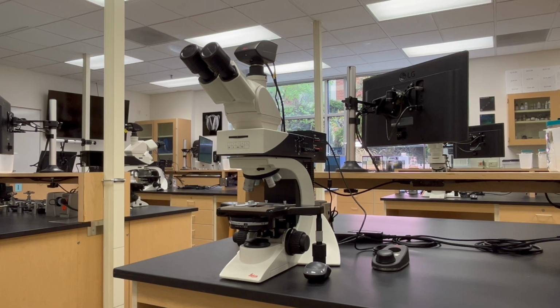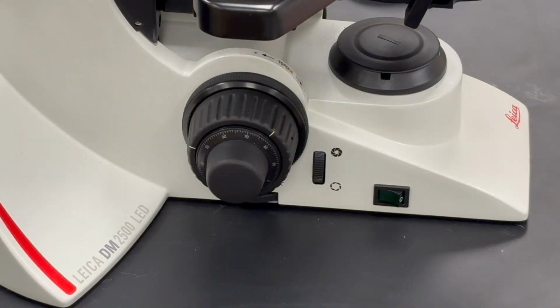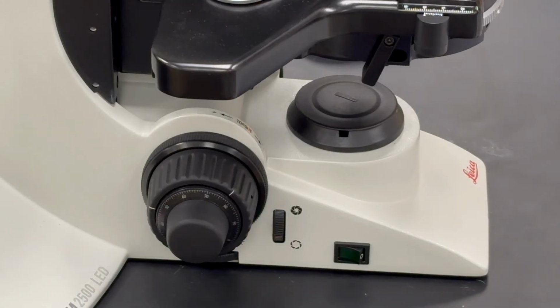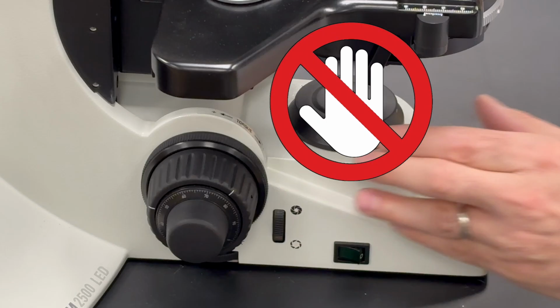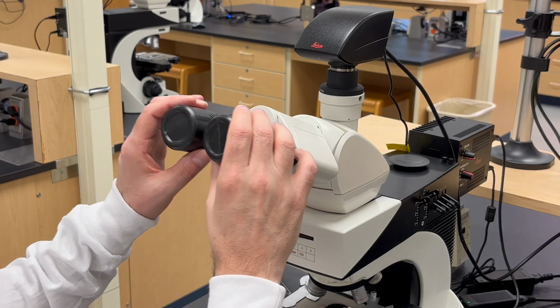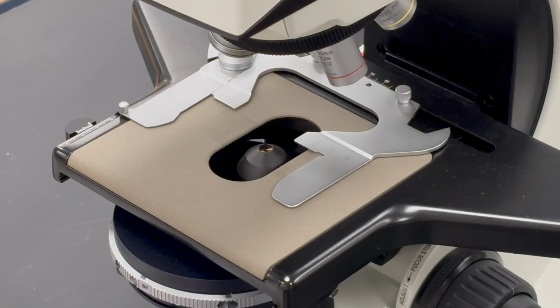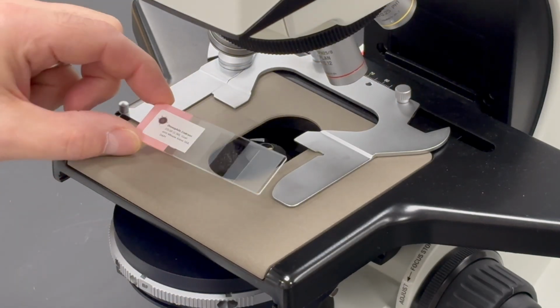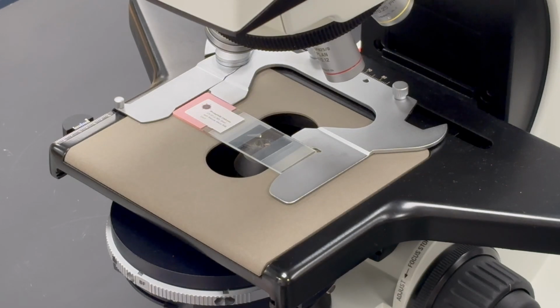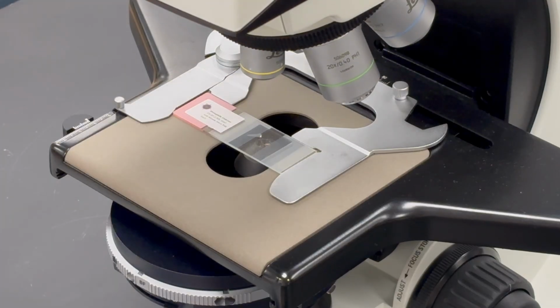If you intend to utilize a mode of microscopy that requires reflected light, such as epifluorescence microscopy, do not turn on the power for the transmitted light source at the base of the microscope, and do not remove the protective plastic cap over the field diaphragm lens. Remove the protective plastic caps over the ocular lenses and place them on top of the microscope. Place your specimen in the slide holder calipers on the stage. Rotate the objective lens turret, placing the 10x objective lens into the optical light path.